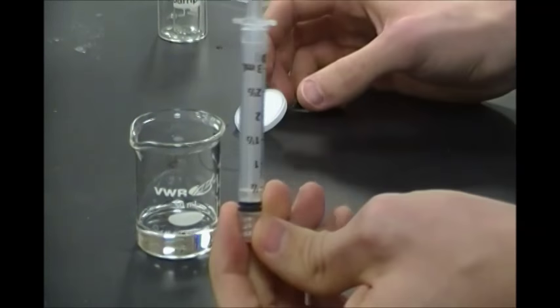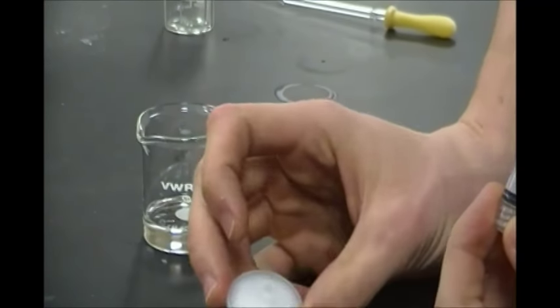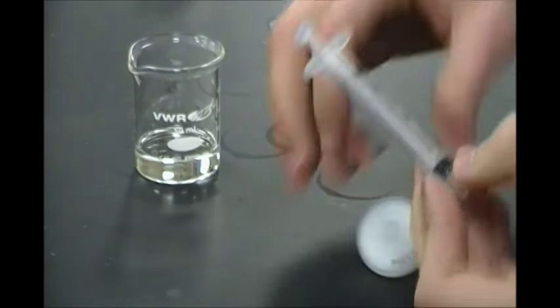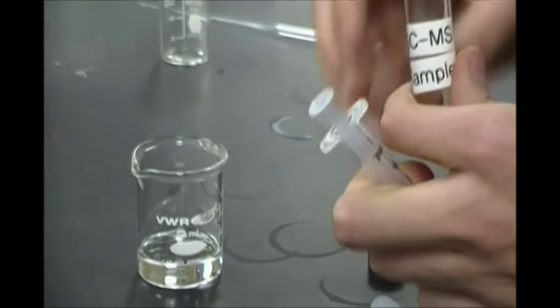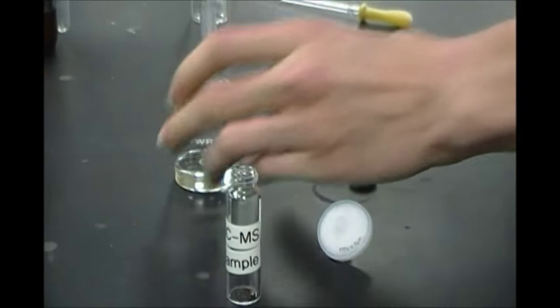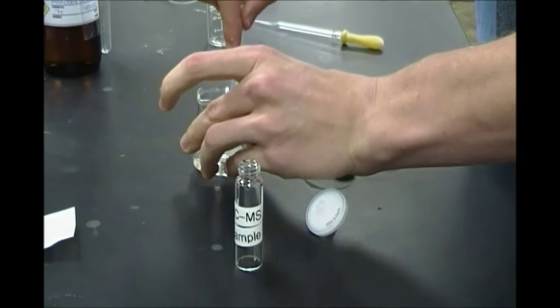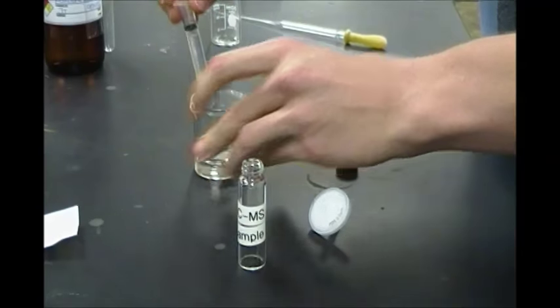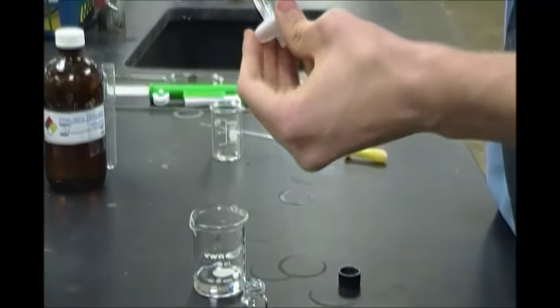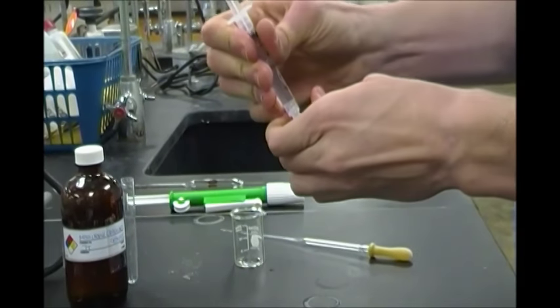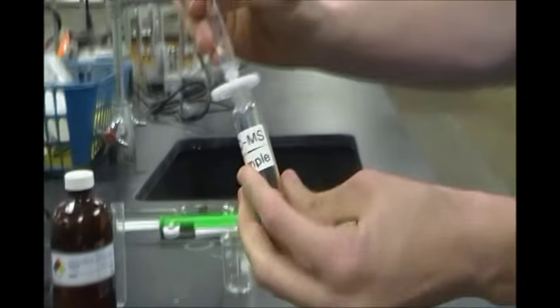We're going to use a 3 milliliter syringe as well as this little screw-on filter here. We'll place it inside this capsule. So we'll just draw up some of our sample into the syringe, put on my filter, and then just filter it through.